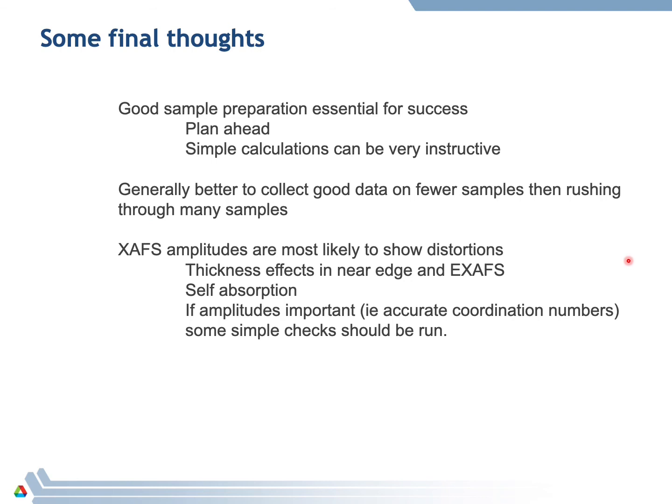So that's pretty much what I wanted to talk about today. I just have a few final thoughts before I close. As I think I've tried to show, good sample preparation is really essential for success. You need to have the proper thickness and the proper uniformity. So it's important to plan ahead before making the samples. And using programs such as XAFS programs, you can run some simple calculations that can be really instructive.